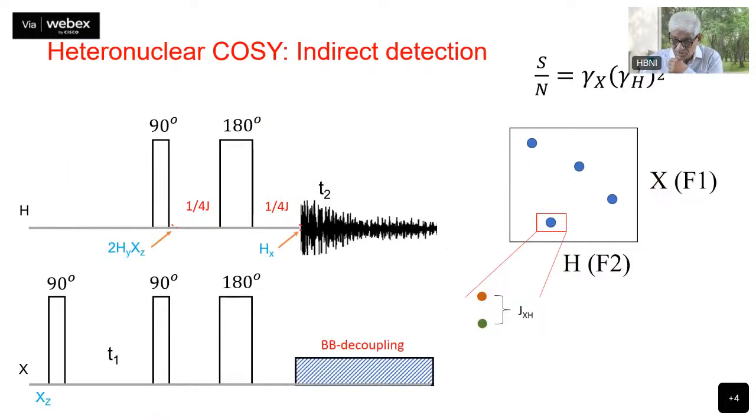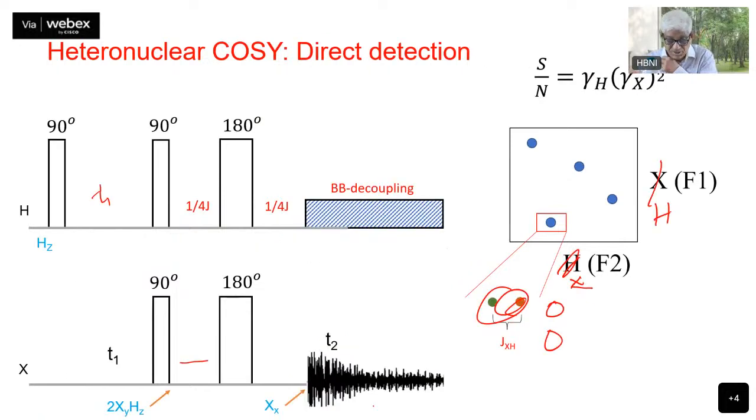So let's see in the previous one what was there. So T2, yeah, T2, okay, this is fine. So here the T2 proton is collecting T2. Proton is along the F2 and X is along F1, and you are decoupling along the T2 dimension. Therefore, there is no splitting along this dimension, you only have splitting along F1. Now here you are decoupling in the F2 dimension, there will be therefore no splitting here. It should be like this only.